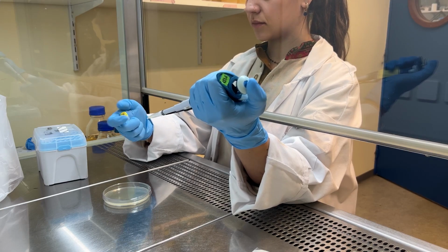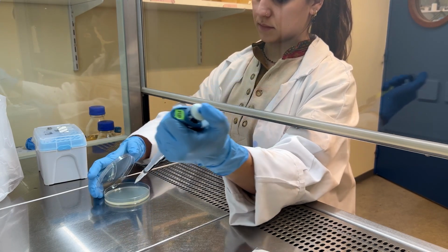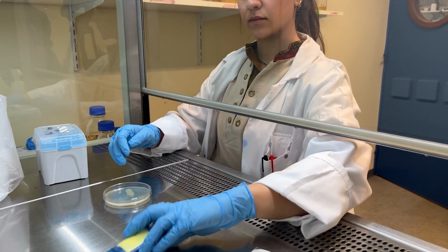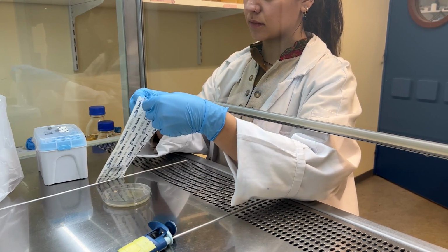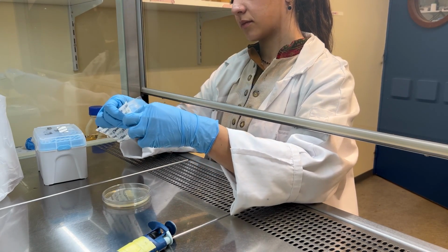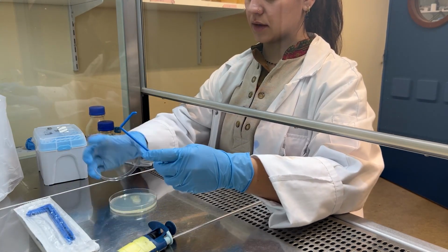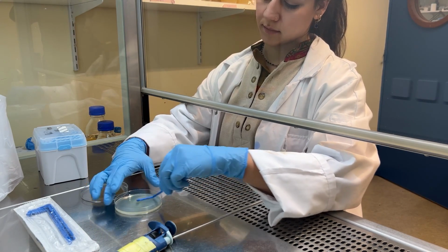After incubation, the mix is recovered and the cells are spread on an LB agar plate containing the appropriate antibiotics. Depending on the amount of DNA used for the transformation, only part of the transformation mix may be spread in order to obtain single and well-isolated colonies. The plate is then incubated overnight at 37 degrees Celsius in a static incubator. It is best to use dry and warm plates.